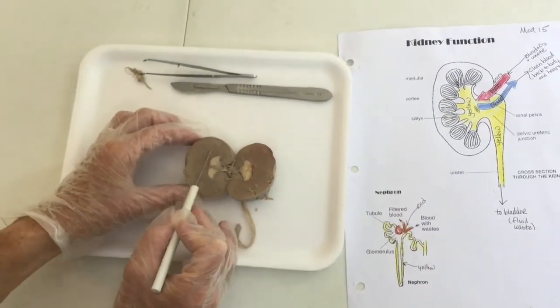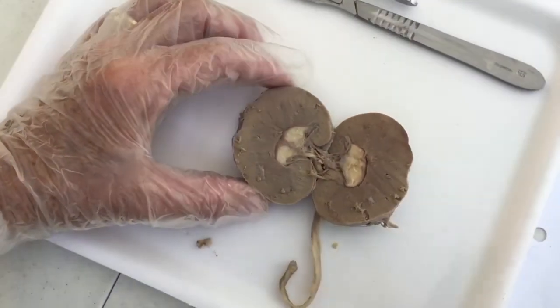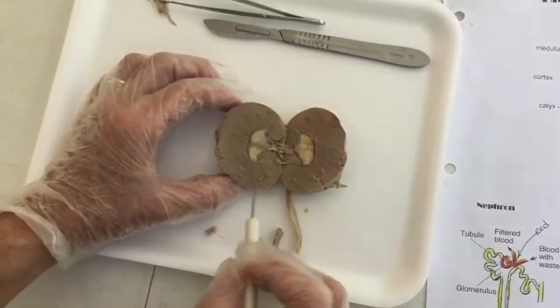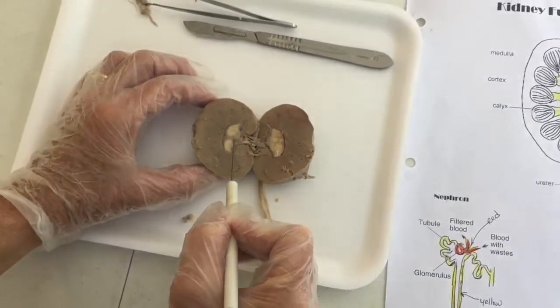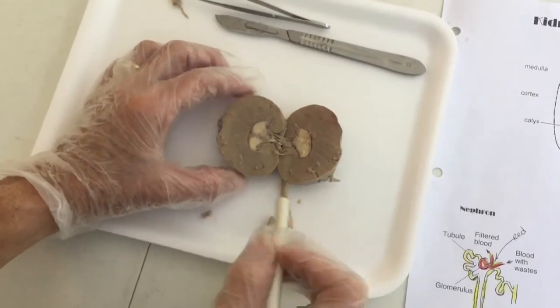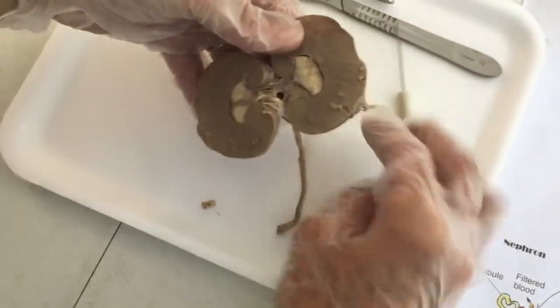I know it's hard to see here, but you do see how it relates to the drawing that we did. So we have our cortex, we have the renal pelvis in here. This is where all of the nephrons are located, and let's see if we can take this apart.